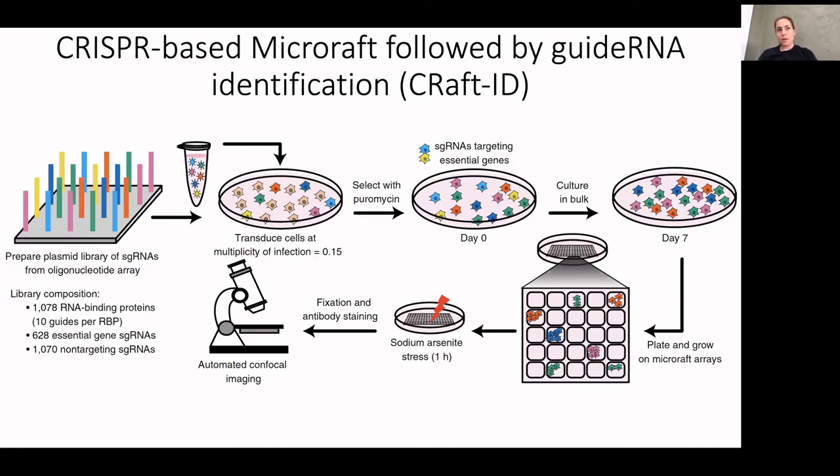There may have been some microscopes that this was not compatible with. I don't remember everything that we had tried, but we used 2 different confocal microscopes, and it was compatible with both of those at the 1 millimeter. It was definitely a concern, and we wanted to use as thin of a piece of glass as possible to be able to get through it, and that worked out well.